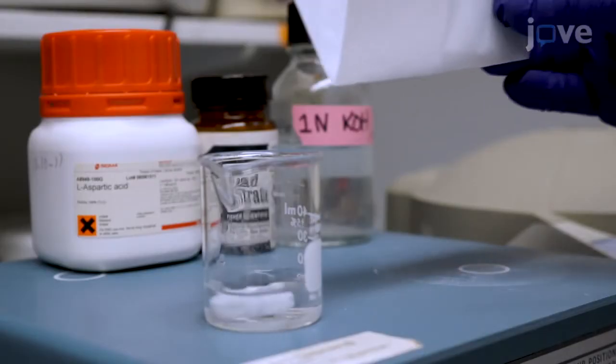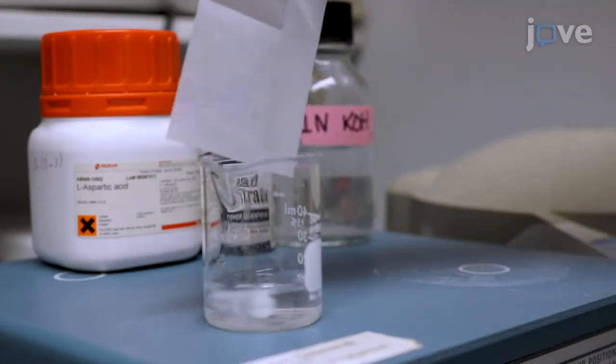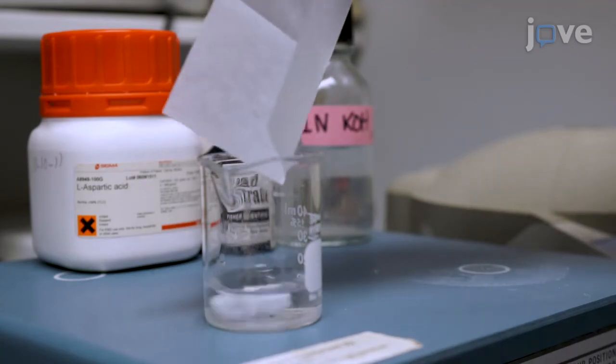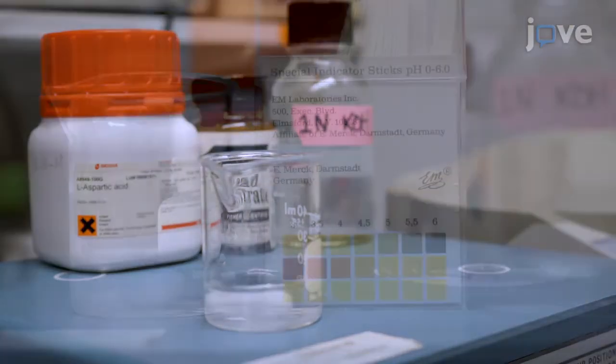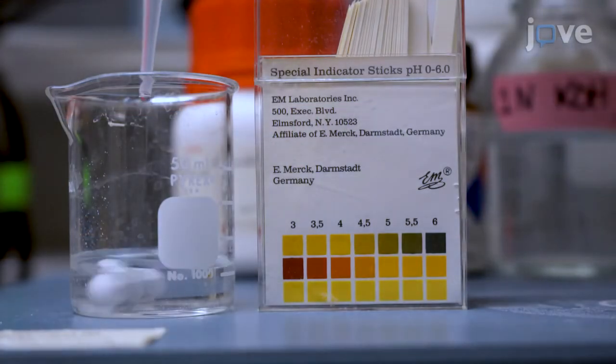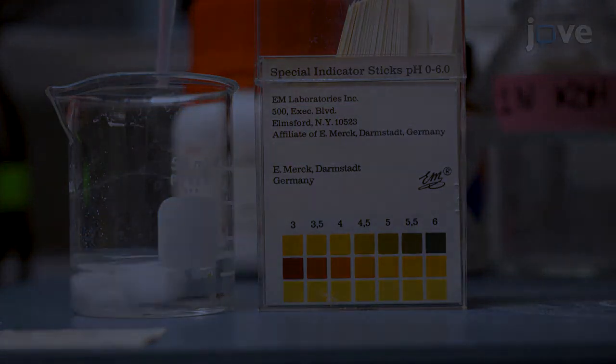The next morning, dissolve 0.066 grams of lead nitrate in 10 milliliters of 0.03 molar aspartic acid solution, and use 1 normal potassium hydroxide to adjust the pH of the Walton's lead solution.